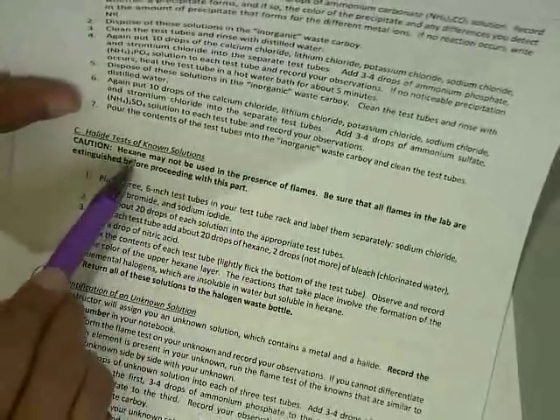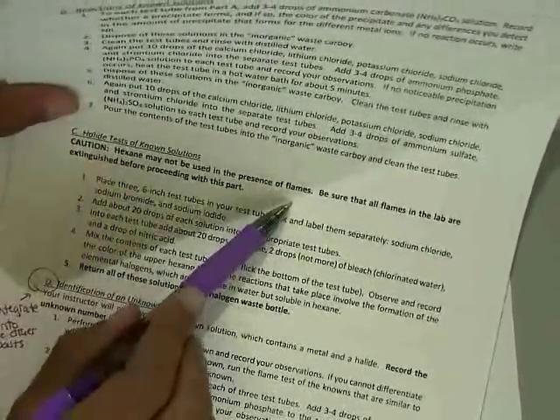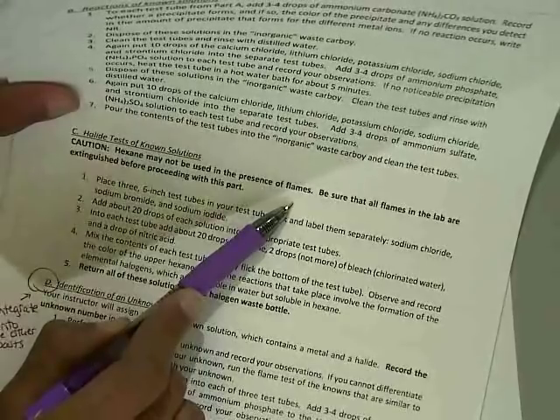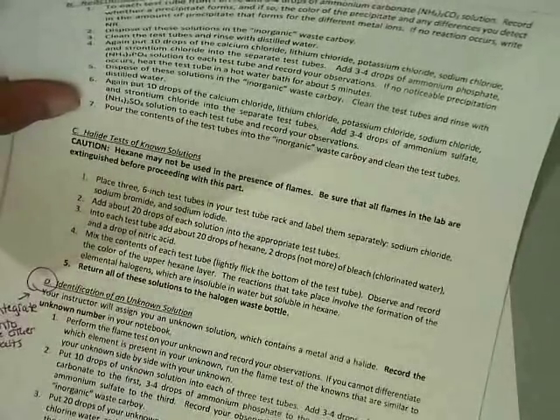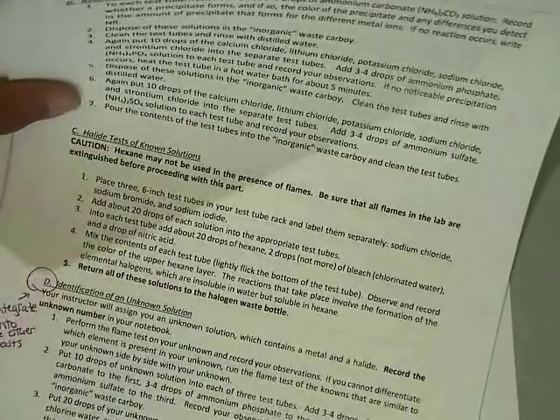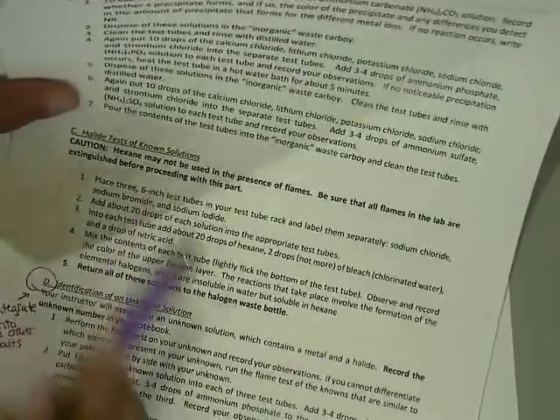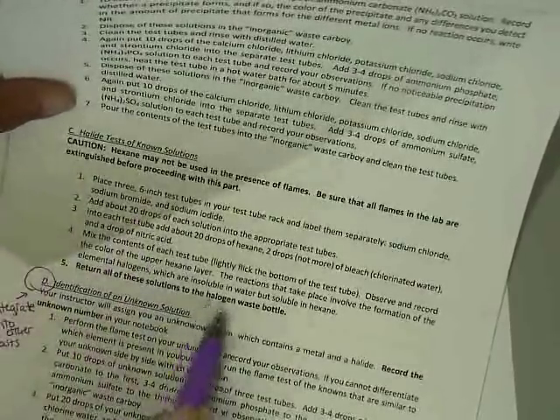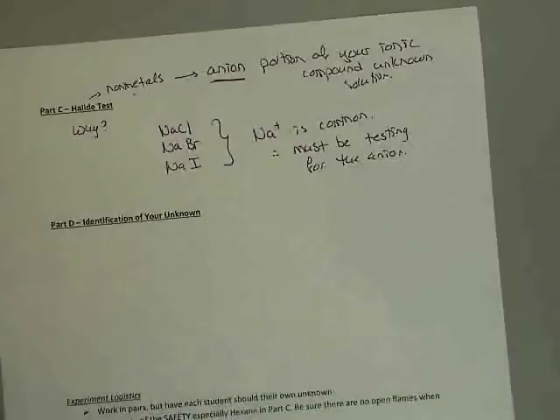So be very careful, because hexanes, if you remember from the MSDS exercise, is extremely flammable, and you should not have any lit flames around you. So check around, exercise proper safety in lab, make sure your lab mates around you have the flames turned off, then you can go ahead and carry out this part. Make sure any waste from part C is actually in the halogen waste bottle. If you're not sure where the waste goes, ask your lab instructor.